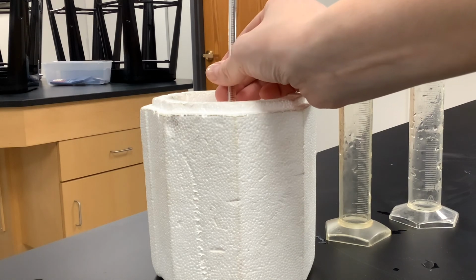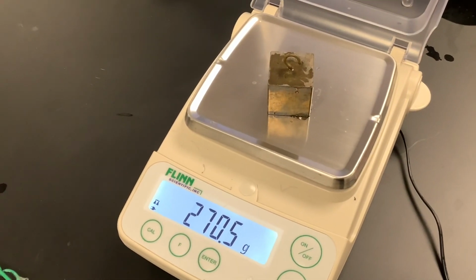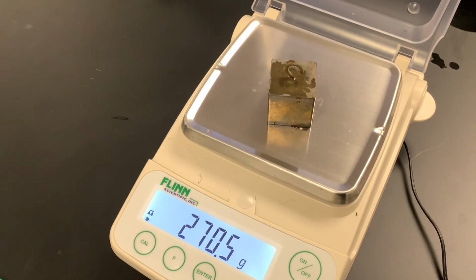Still climbing, we're at 26 right now. Okay, our final temperature was 30 degrees Celsius, so that's the final temperature of both the calorimeter water and the metal cube. So record that in your data table.